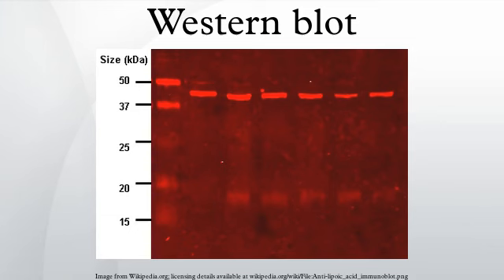The Western blot is a widely used analytical technique used to detect specific proteins in a sample of tissue homogenate or extract. It uses gel electrophoresis to separate native proteins by 3D structure or denatured proteins by the length of the polypeptide. The proteins are then transferred to a membrane, where they are stained with antibodies specific to the target protein. The gel electrophoresis step is included in Western blot analysis to resolve the issue of the cross-reactivity of antibodies.